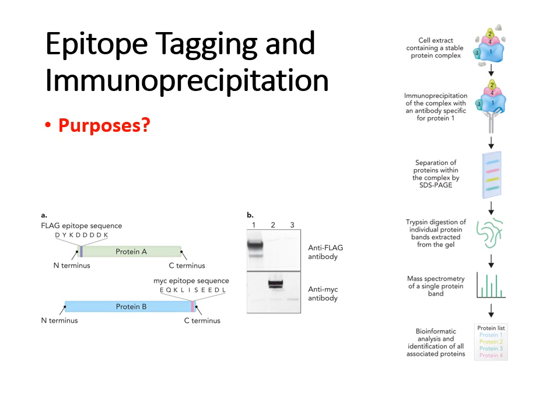So they came up with procedures to epitope tag proteins, meaning to take any protein you want and add a specific little epitope sequence, a sequence of a few amino acids, that you can stick onto that protein. Once you add that, there are commercially available antibodies to target it.